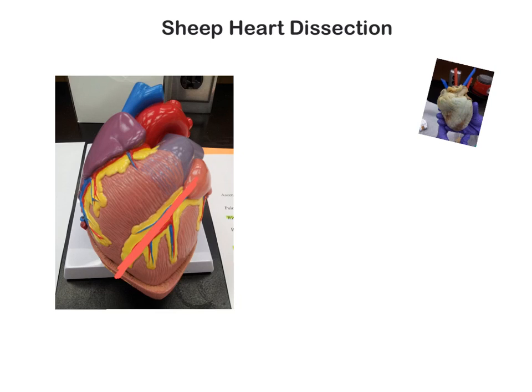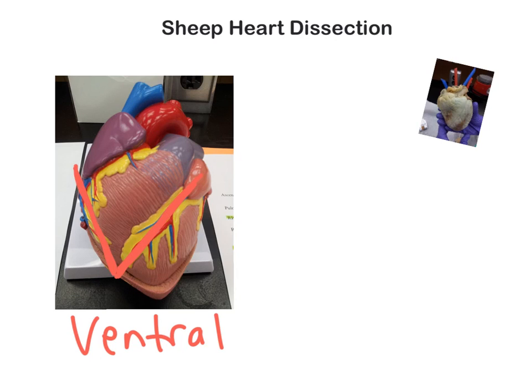What I kind of think of is that it's making a V, and V is for ventral. So that's the first thing I look for to determine that that is the anterior surface or the ventral surface of the heart.